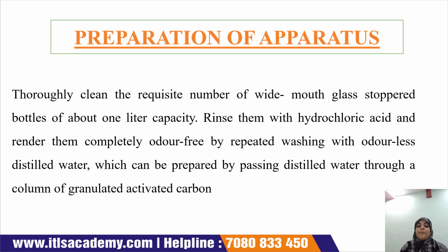Now the next is the preparation of the apparatus. After selecting the sample, we have to prepare our apparatus so that we can perform the experiment, because it is a sense experiment.